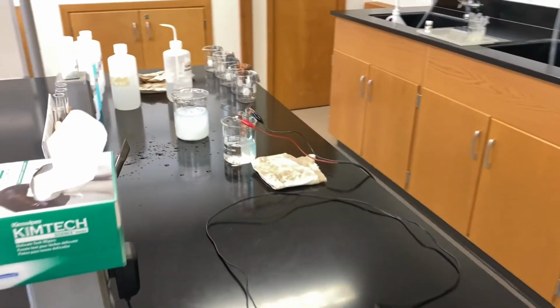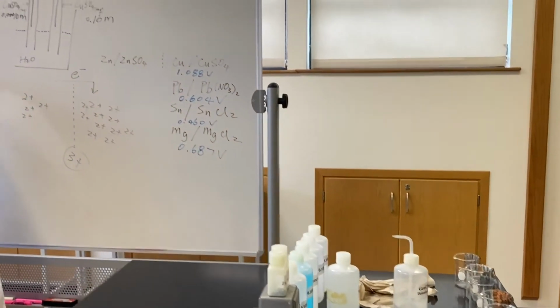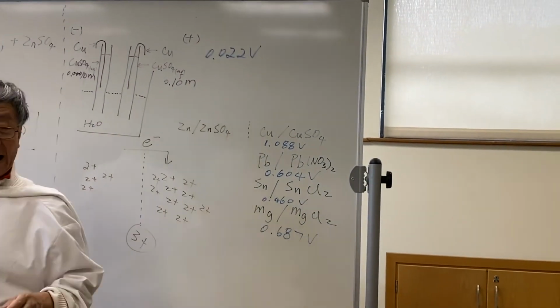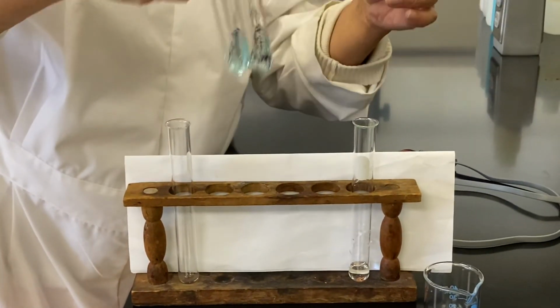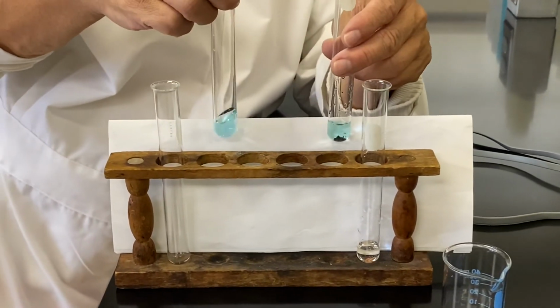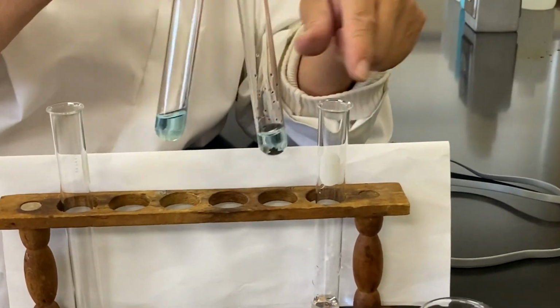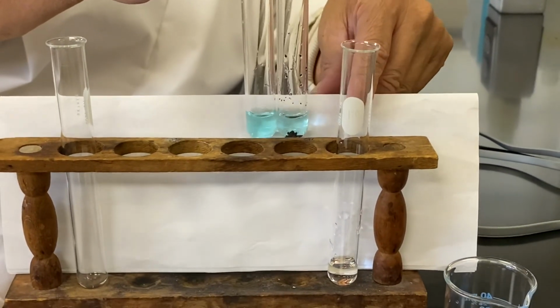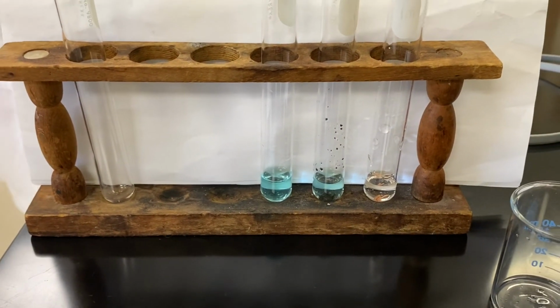Your professor will also discuss which concentration half cell will be the anode and which will be the cathode. Usually demonstrated this, all right? And this is how when they start sky blue, and now it's almost colorless. And what does that indicate? Remember to record all your observations in the lab manual.